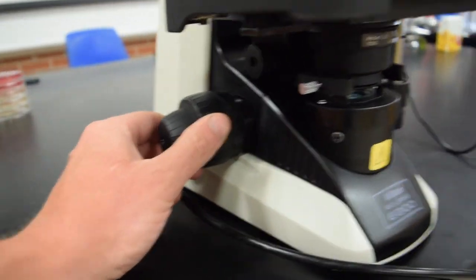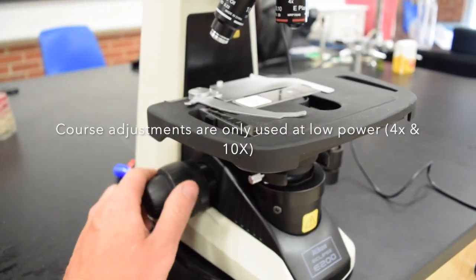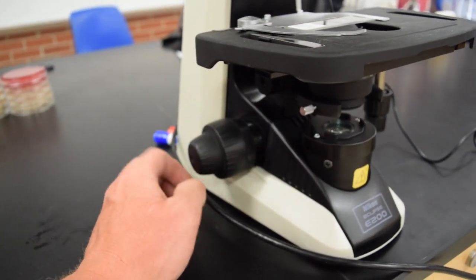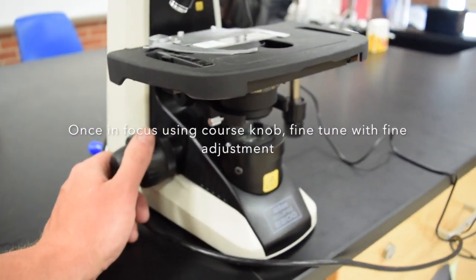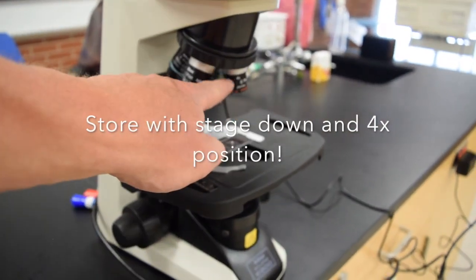Here we have the coarse adjustment knob - you can see the stage moves up and down very rapidly. The outside portion is the fine adjustment knob, which moves the stage very slowly. When you store the microscope, store it with the stage all the way down in the 4x position.